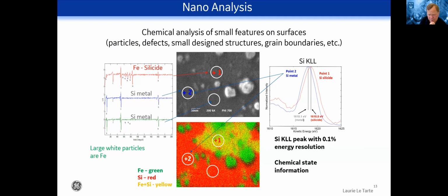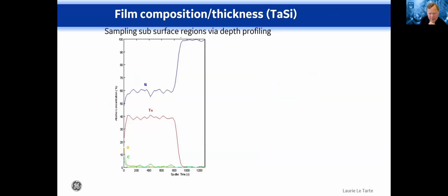This is a nice example where we're doing top-down surface analysis. A lot of times people need to know what is happening throughout the layer thickness, and EDS analysis of a cross-section isn't able to provide the correct information. So what we can do is a series of analysis and erosion steps that's referred to as a depth profile. Here we're mapping the chemical composition as we step through the layer.